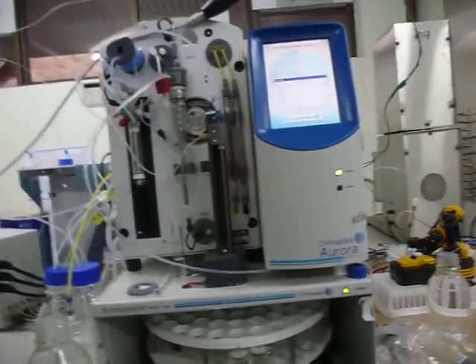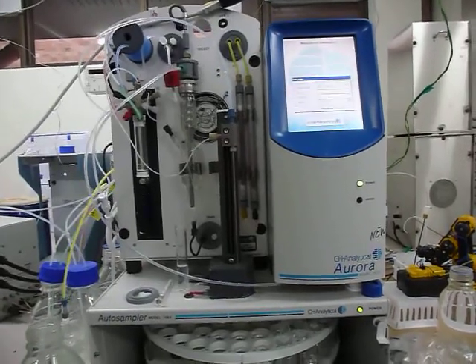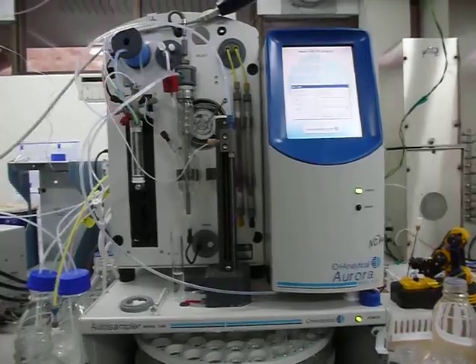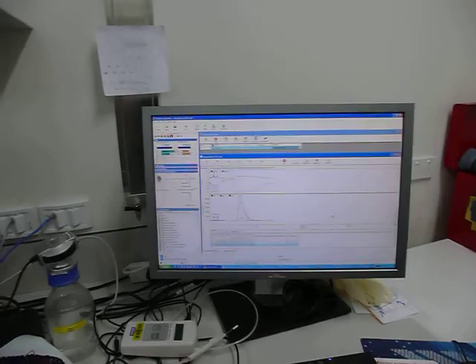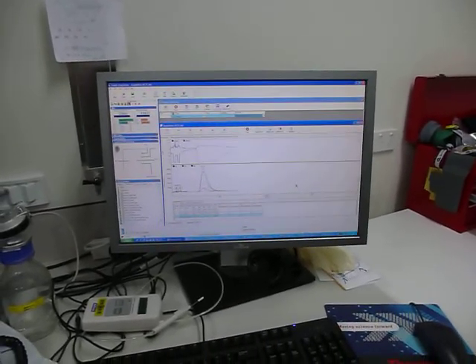Basically what I want to demonstrate here is that it's possible to use the TOC analyzer together with the robotic arm and save a lot of money, about $20,000. This TOC analyzer is relatively common. It's probably not the most common. Shimadzu is common. I made another video showing that the robot can be used with the Shimadzu TOC analyzer.